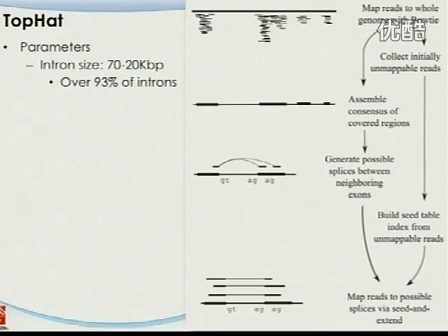But sometimes, just based on the first level approach alignment, you won't directly touch on the exon splicing sites. It's very rare to do that. So you have to do some extension of the region and find the gene sequence that represents the splicing. Biologists know that the splicing site is GT from this end and AG from this end. Not 100%, but in most cases it is. So taking advantage of that, you search for these regions and try to define the exon boundaries.